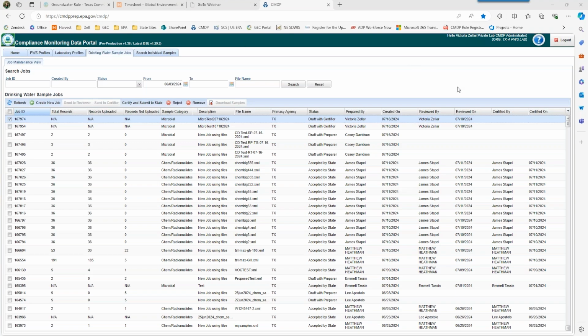And what that is, you'll need to submit 3 samples of each different type. This is microbial, so repeats, routine, positives, TC positive, DC positive, and so on and so forth. And that's outlined in our lab SOP that's on our PWSSP page. And once you have that approval, then you can begin submitting those samples through CMDP and discontinue submitting those through the existing methods.